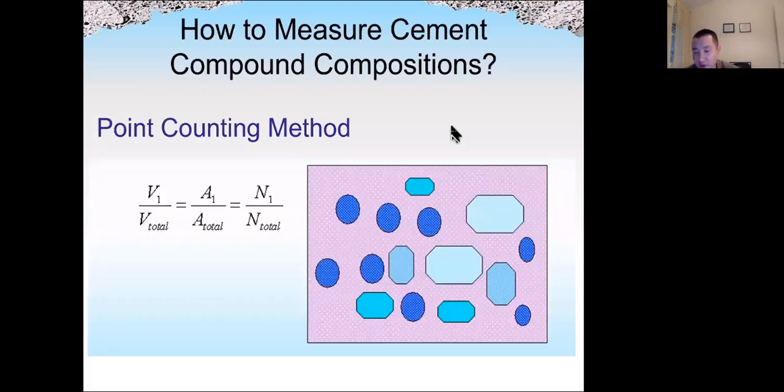Today, I think we're going to talk about XRD and also MIP if we got time. Okay. How to measure cement compound composition?